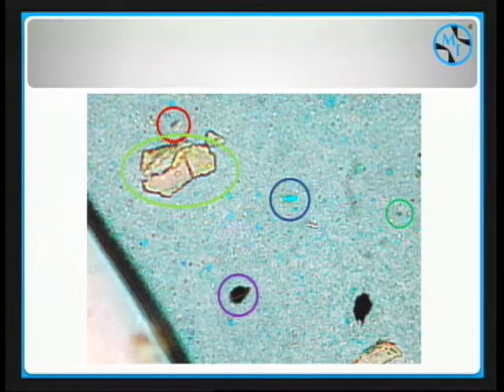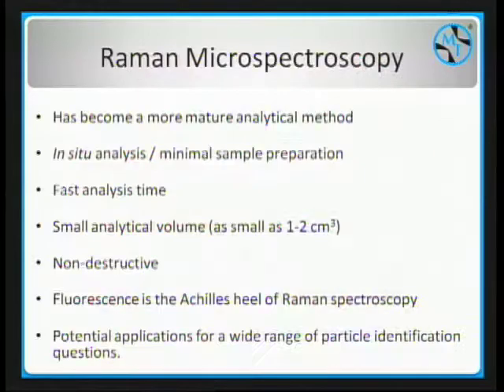So this is a PLM image of a thin section of paint. It doesn't look as good here as it does on my screen. You can see there's some opaque pigments, circled. This is a blue paint, but the dark opaque pigments down here are metallic flake. There's micas. There's blue, a larger blue pigment, but they go down even smaller than you can resolve. There's a green pigment here, which hasn't turned up very well, and there are red pigments in here. So in a single paint, just by light microscopy, you can see that there's a variety of pigments.